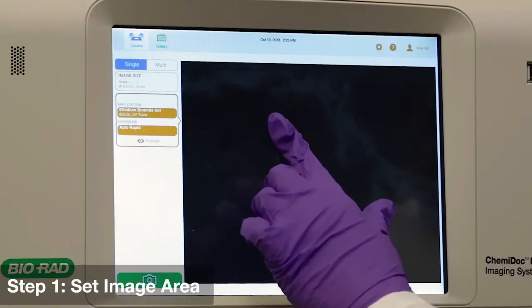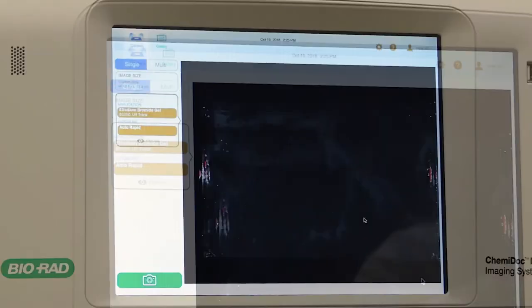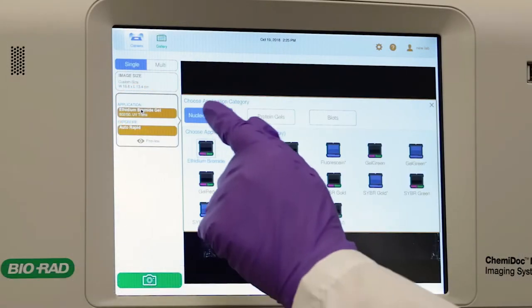Zoom in to the desired imaging area, or you can simply select Image Size. Tap Application to select the category and stain appropriate for your sample.